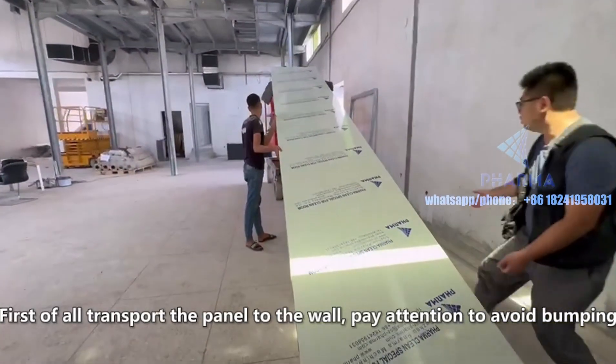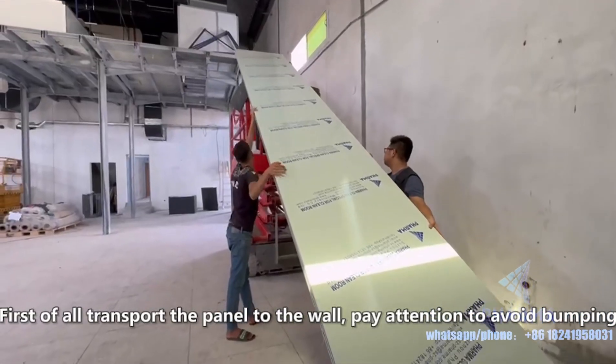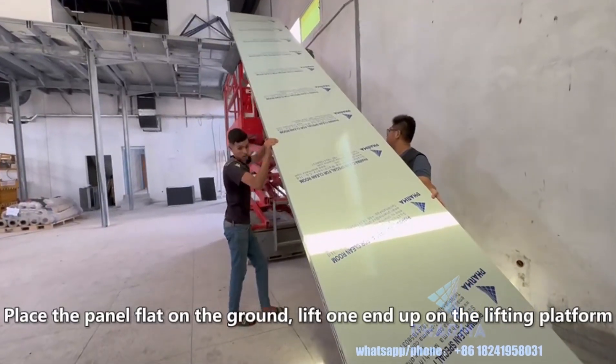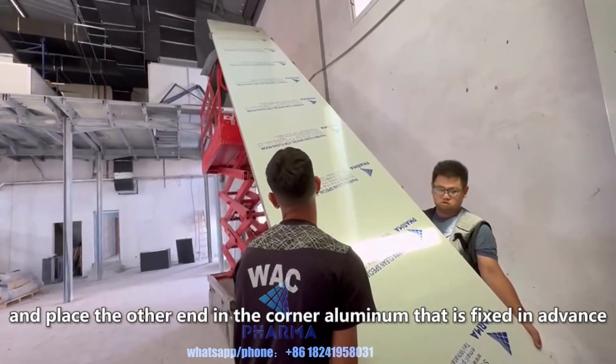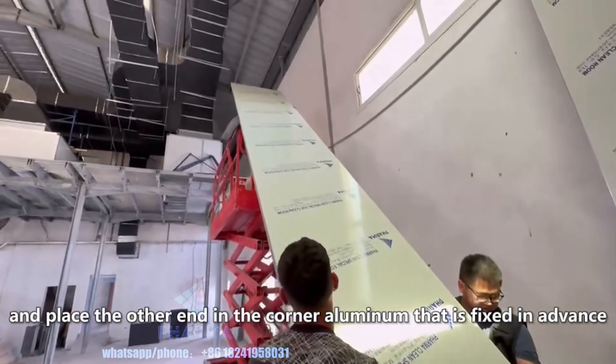First of all, transport the panel to the wall — pay attention to avoid bumping. Place the panel flat on the ground, lift one end up on the lifting platform, and place the other end in the corner aluminum that is fixed in advance.